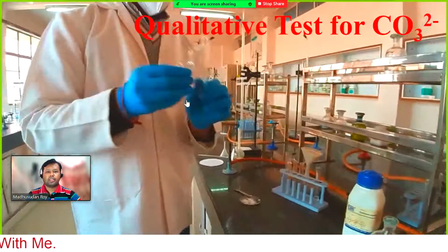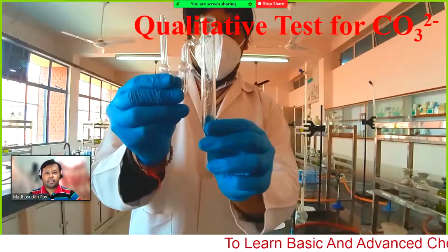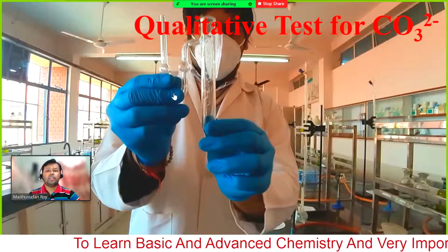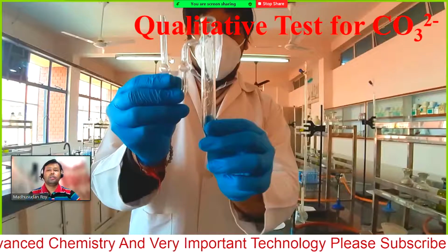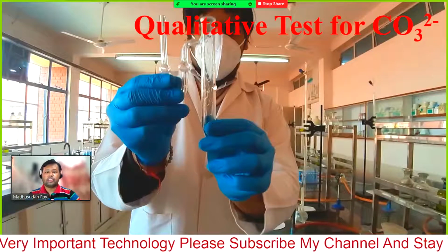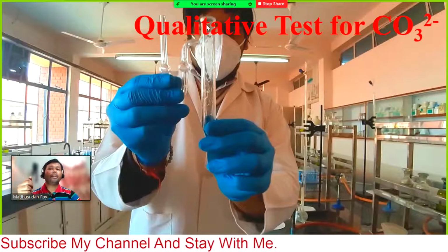Then taking another test tube. Okay, this is the U tube, already attached with a test tube, and this is the bend part. In this part you will add calcium oxide or lime water solution, clear lime water solution, so that when you add the acid, you need to stop the mouth of the test tube with your finger immediately.